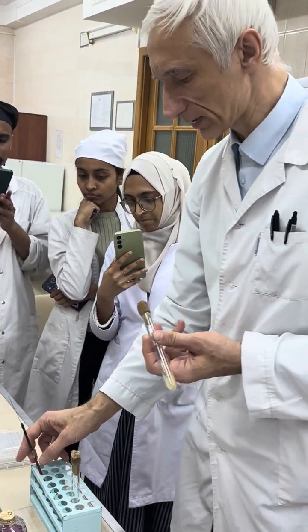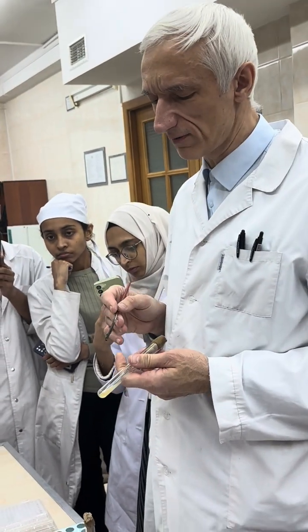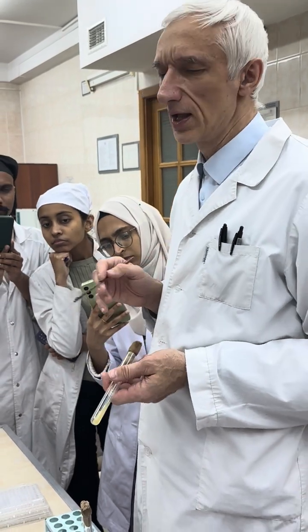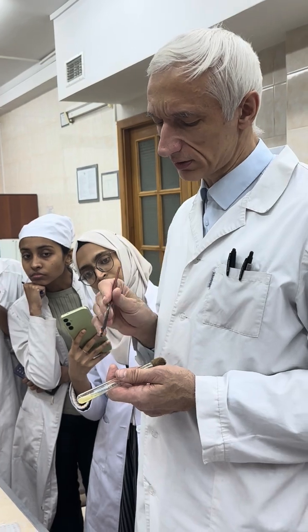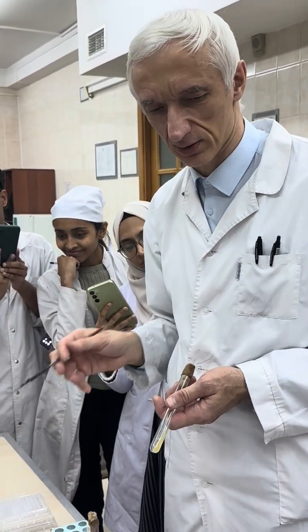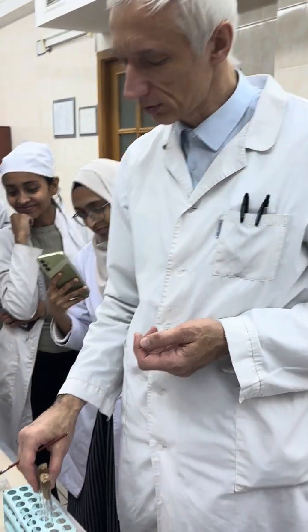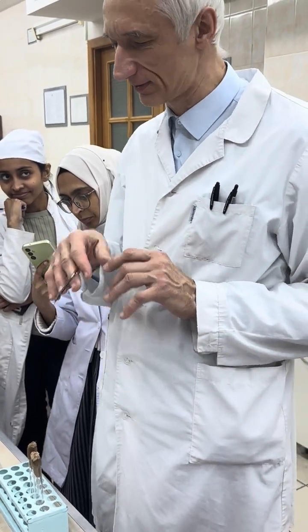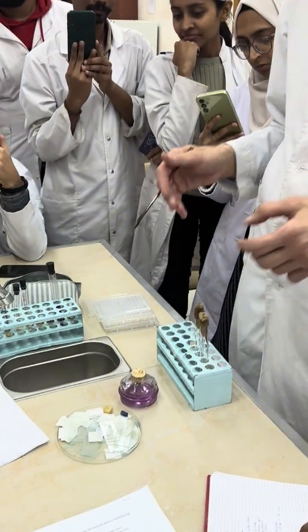Again, the same taking of material, opening, and standard procedure. My recommendation, if you remember: take a minimalist amount, almost invisible, a little bit of scratching and so on. I haven't seen such mistakes yet, but someone tried to take something from inside and took pieces of agar, which look like icebergs in your lake of saline. It is impossible to press them and transform them into microbes. It's visible by eye without a microscope.